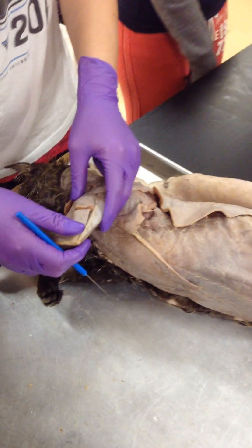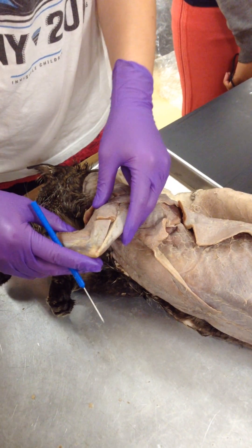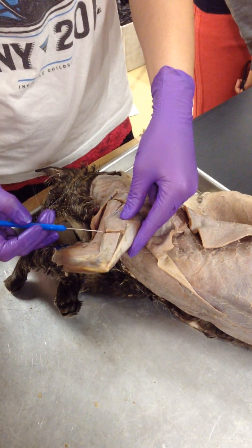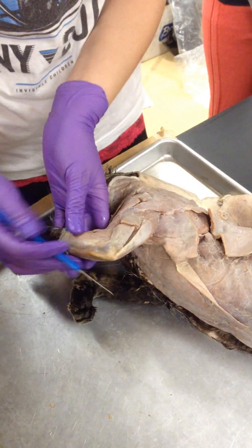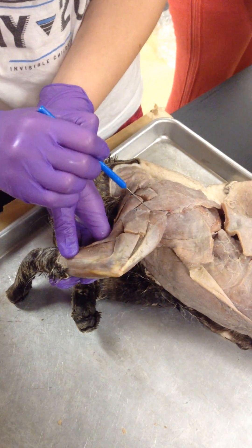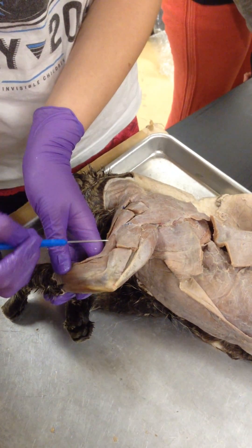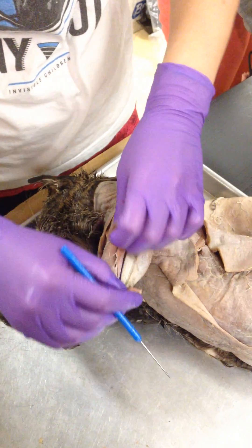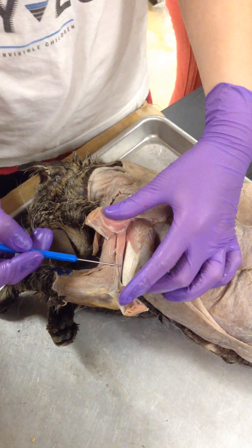Should you cut the acromion deltoid in this one? I thought his arm muscles were so good that I didn't touch anything. So here is your triceps. You have three heads to your tricep. This big guy down here, that's the long head of your tricep. This guy right here is your lateral head. Underneath the lateral head, right here, that's the medial head of your tricep.